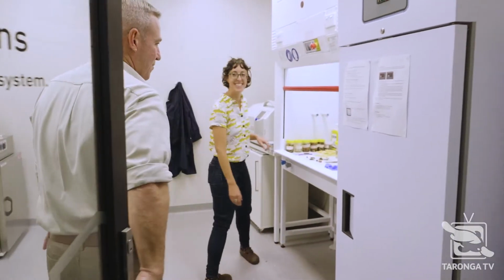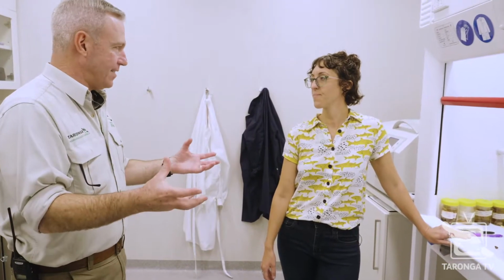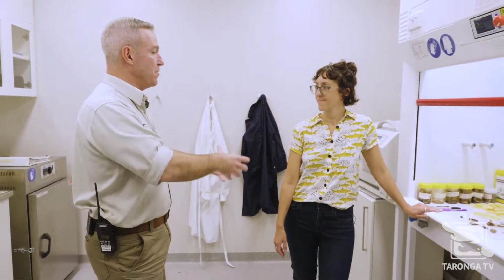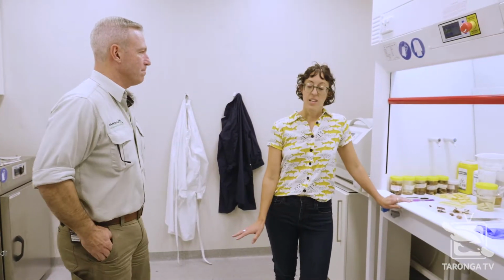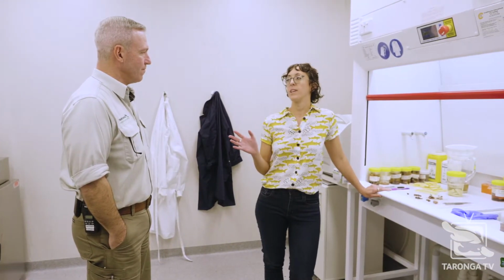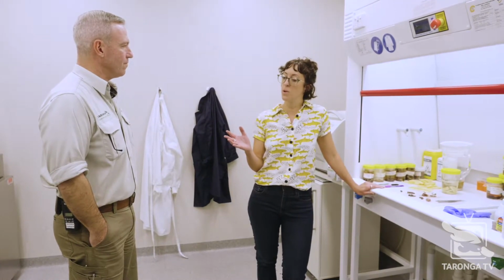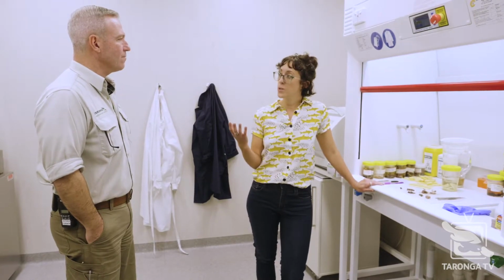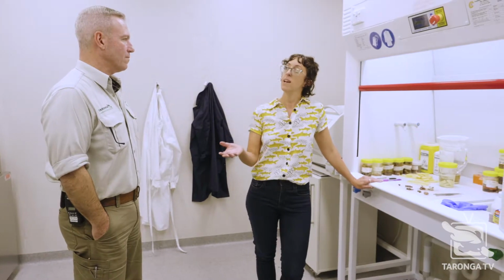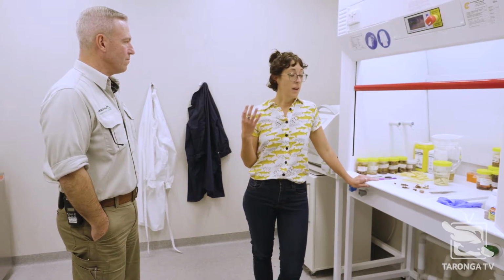Very well, thanks. So we've just been with Jane, and Jane has talked about collecting samples in the wild, and she's got 2 packages of samples that she's brought back to you. What happens next? Right. So the field necropsy investigation has been conducted, and that really is only the first part of the job. We've gone out, we've looked at the animal, and sometimes we know what's wrong or what has caused the disease, caused death, based purely on the gross examination, but often we have more questions, and that's when we bring the tissues back to the lab to complete our examination.